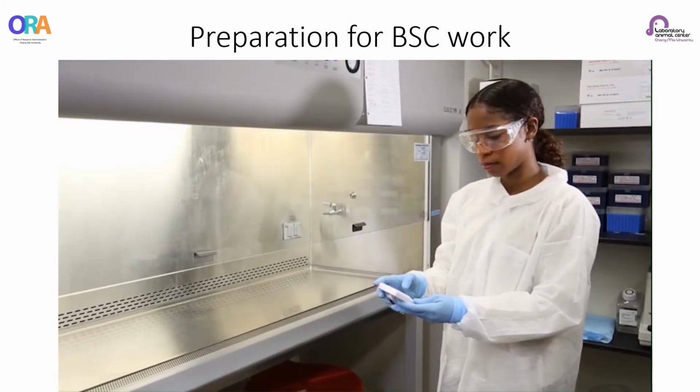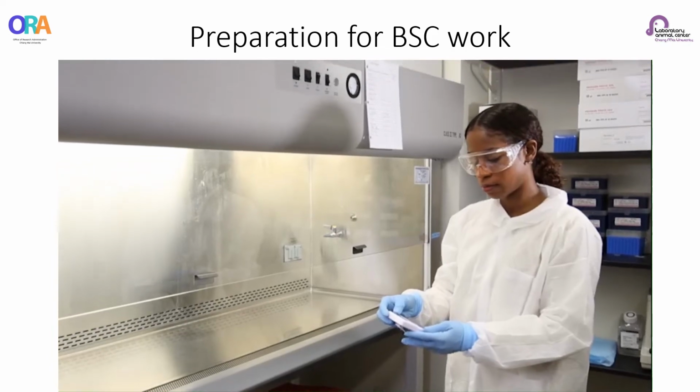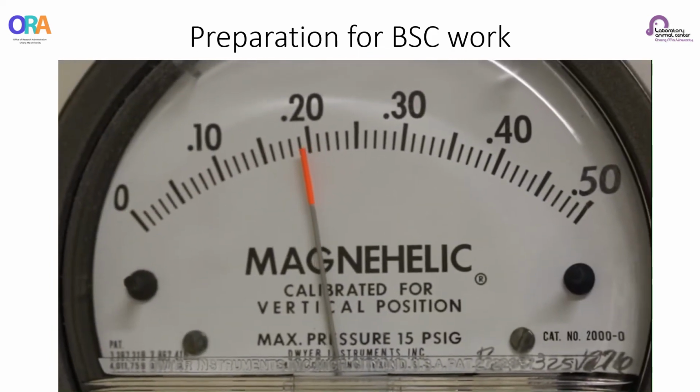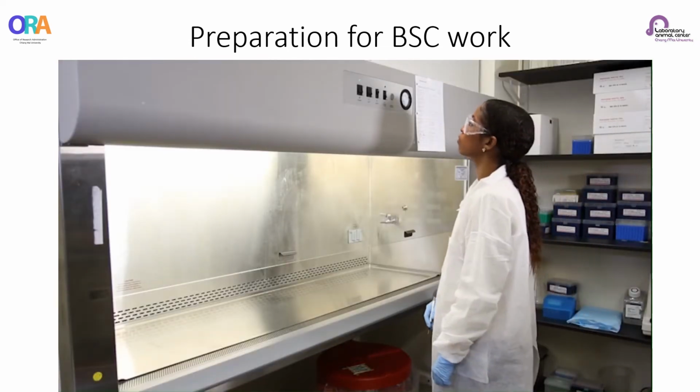Allow the cabinet to run for at least 4 minutes in order to purge the air of particulates inside the BSC. If the BSC has a pressure differential gauge, also called a magnehelic gauge, this may be checked and recorded.